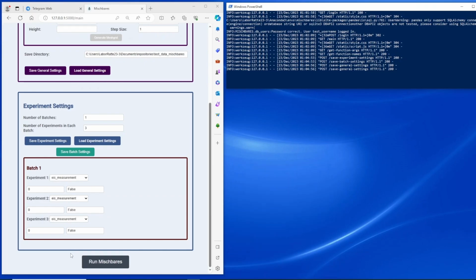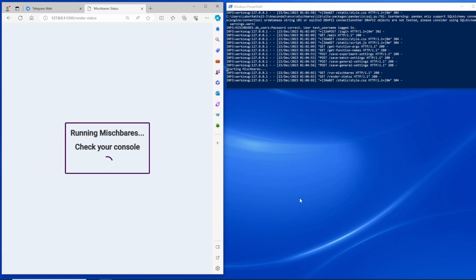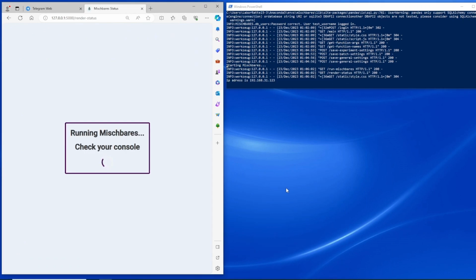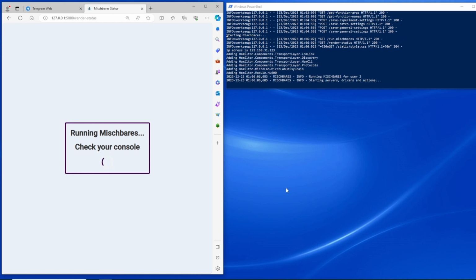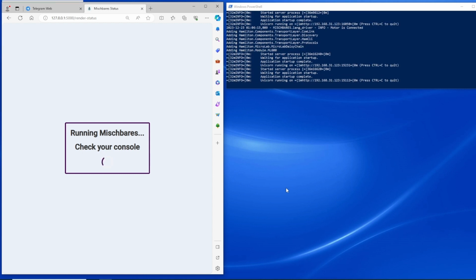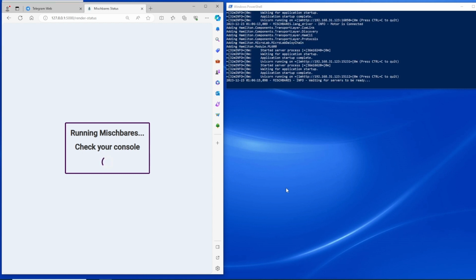Now I would like to demonstrate all the steps at once with a real working electrode rather than a dummy cell and explain the remaining steps for quality control assessment. Initially, I defined one batch in which I plan to run 3 electrochemical impedance spectroscopy experiments. After clicking Run, we wait for all servers to be ready, monitoring their health status until the visualizers pop up.